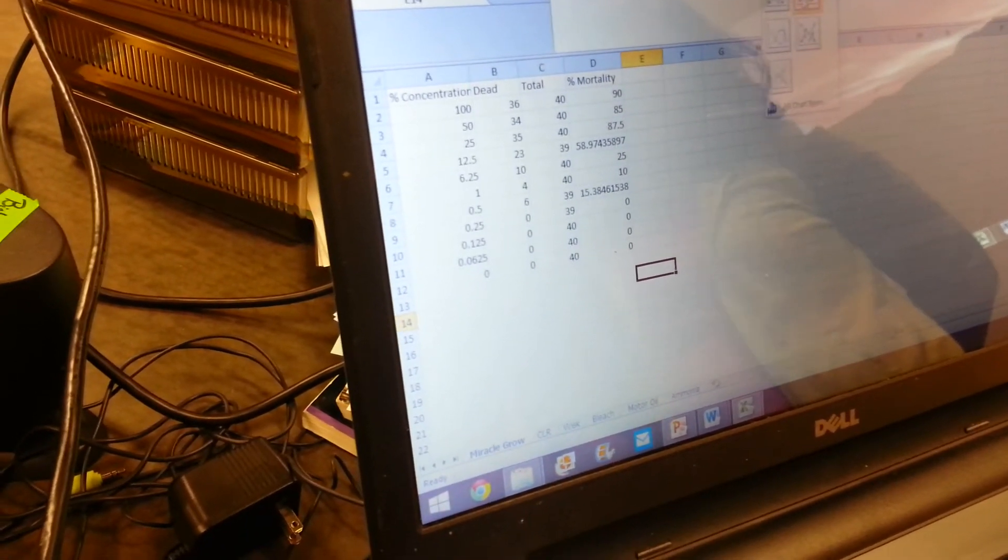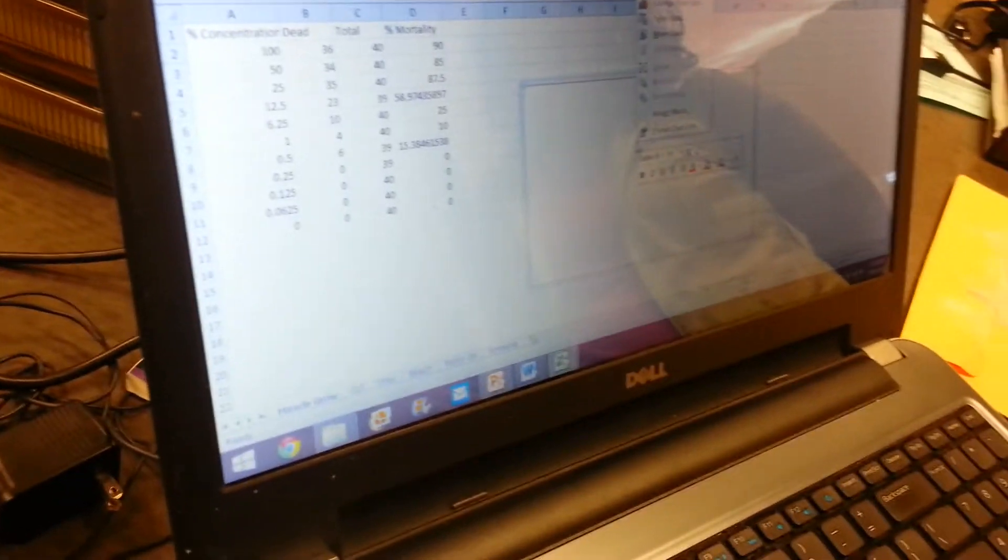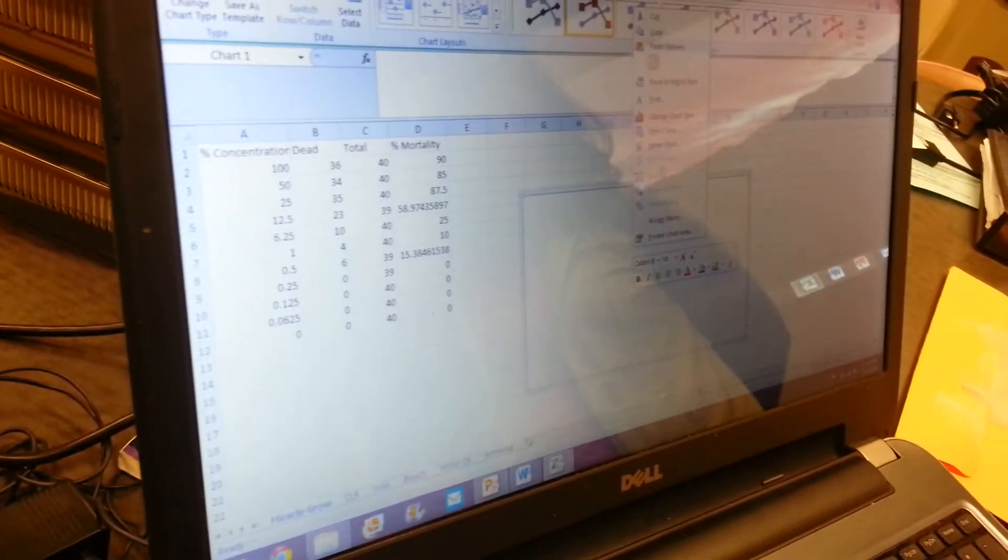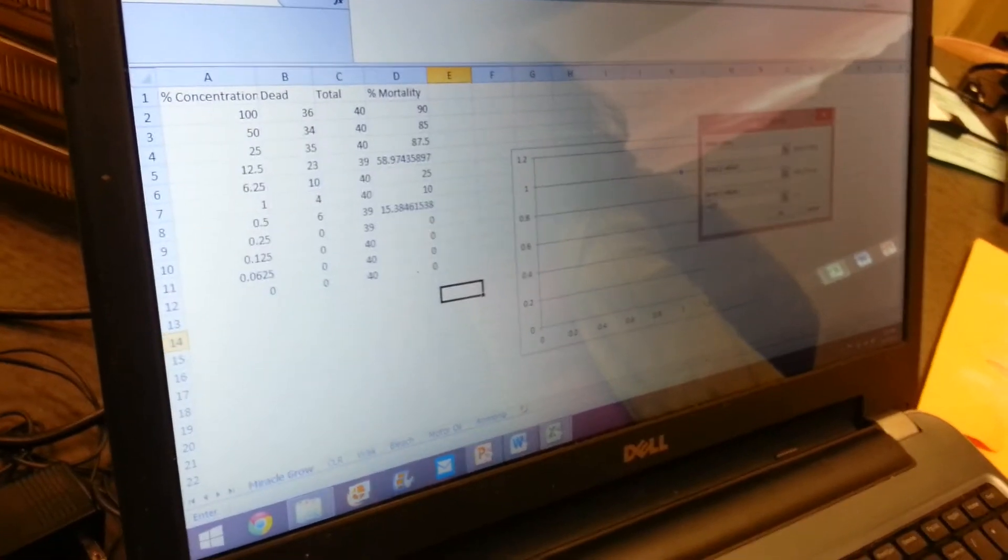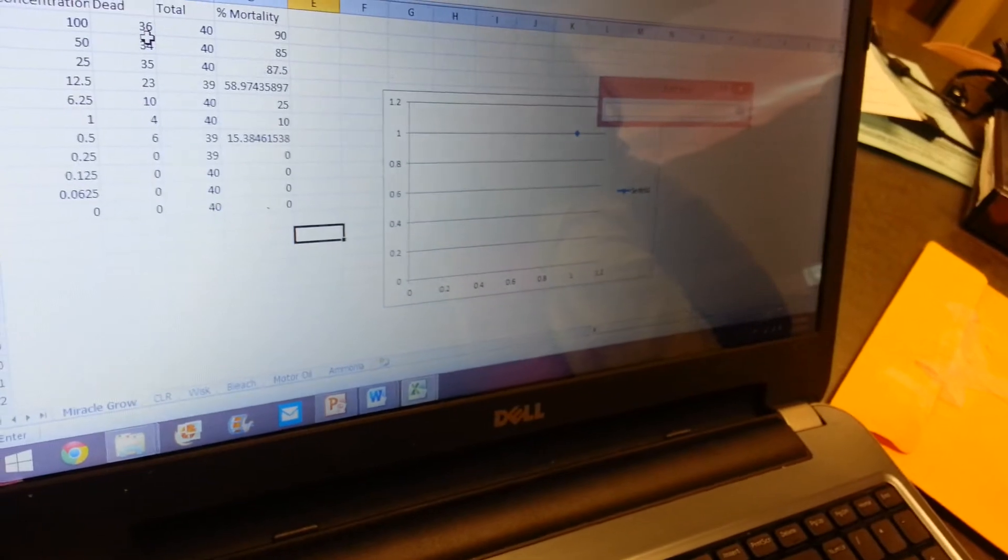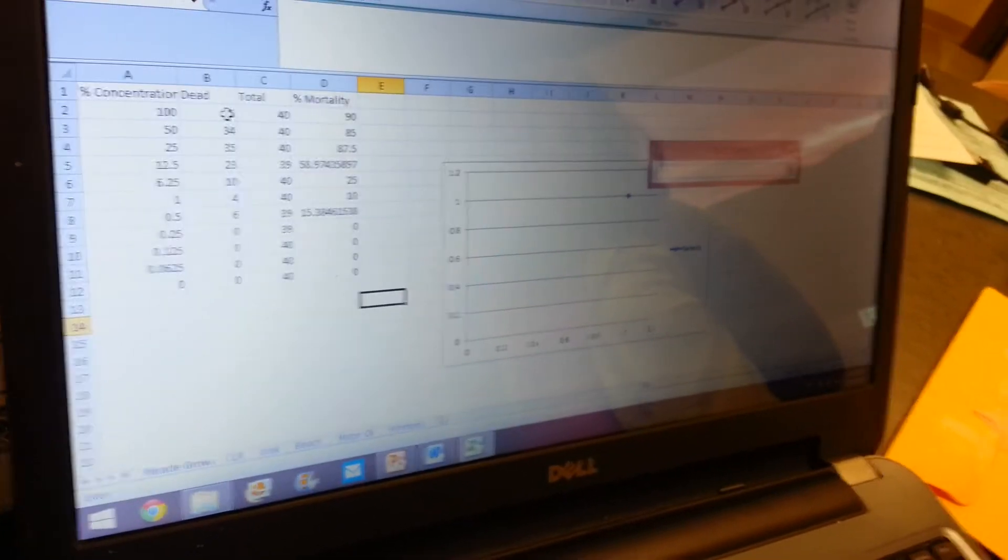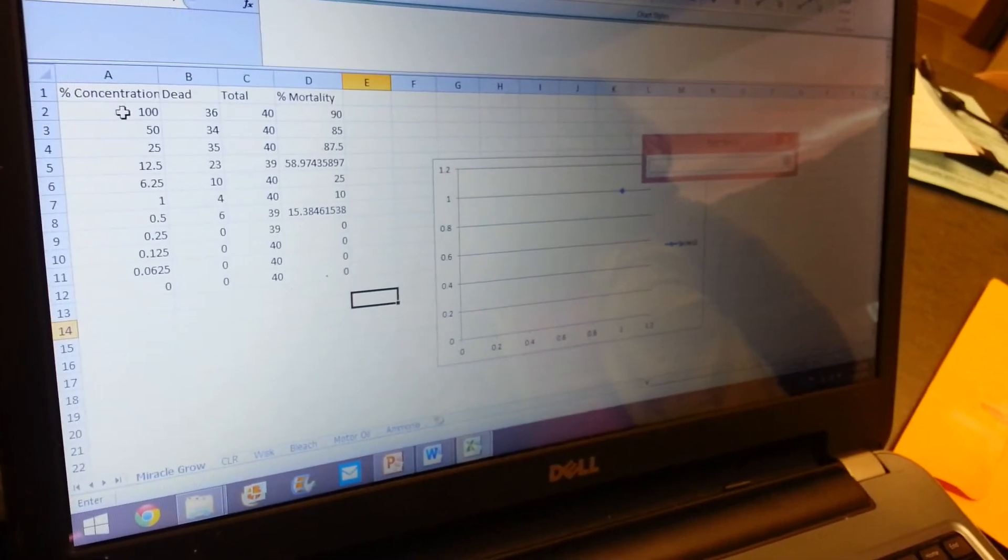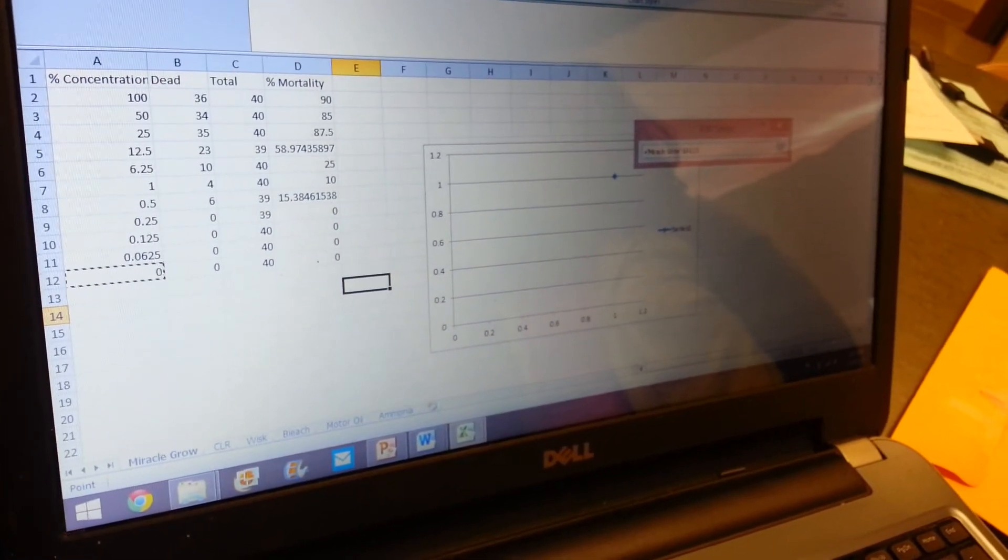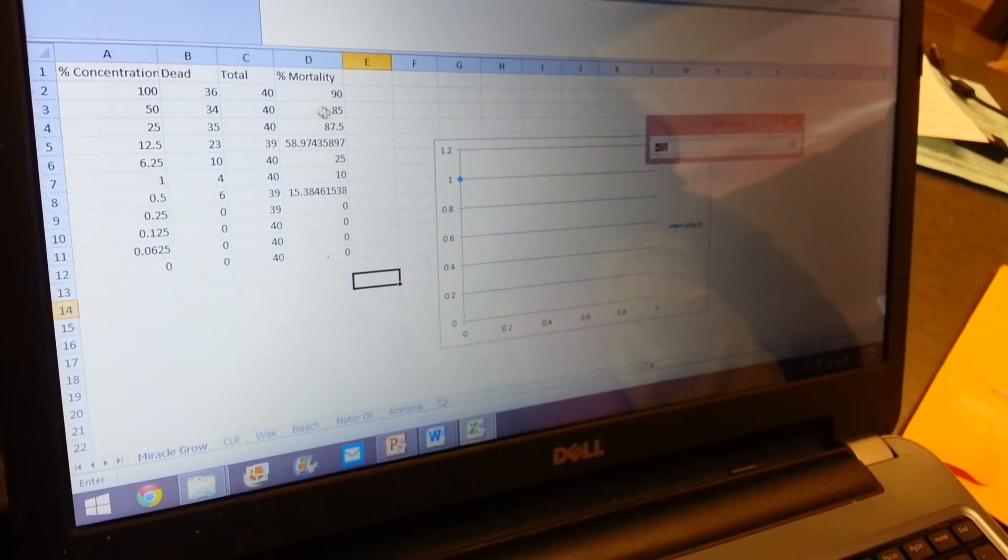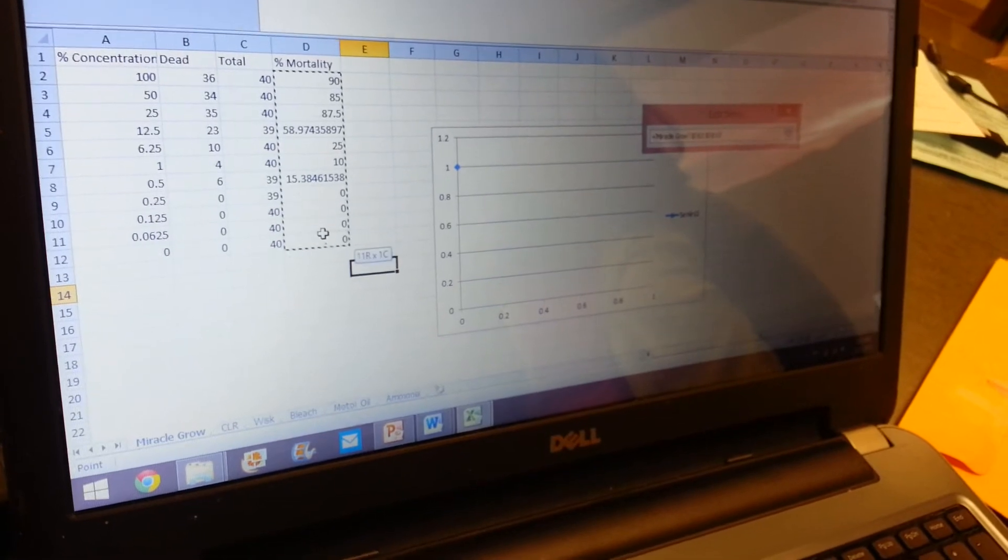All right, so to make your graph you go to Insert and you want to do a scatter, not a line. Just make sure you choose a scatter with the smooth line. And then to select data, you can go to Select Data, go Add. This is where you can change your series name, but you want your X value. Just click on that and you want that to be your concentrations. And then you want your Y to be your mortality, your percent mortality.